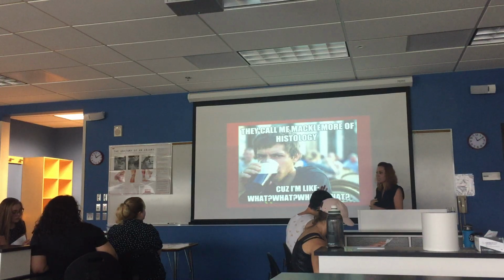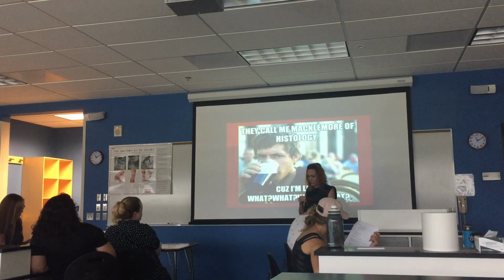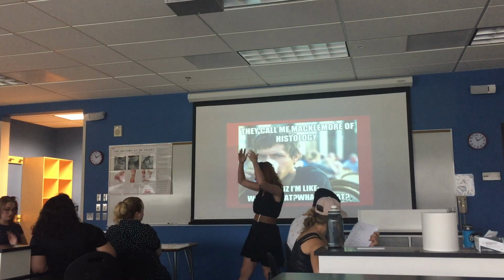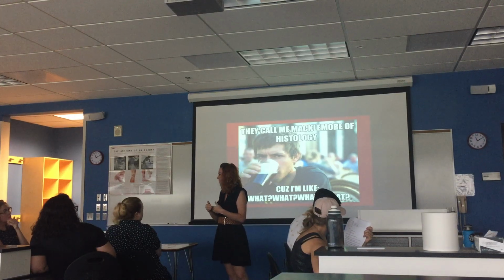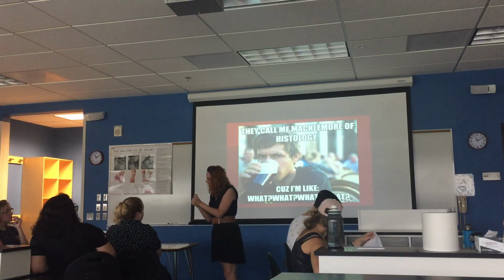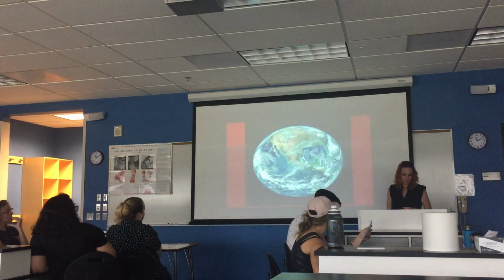Google image searching is super powerful for doing histology. Like if you're looking at your slide and you're like, I don't know if I can really see my ciliated pseudostratified columnar epithelial tissue that I'm supposed to be looking for. Okay, you can Google image search that, and it'll show you so many other versions of it that you'll be able to identify it on your own slide after that, right? Another thing is that you can also use your cell phones and put them up to the eyepiece, the ocular, on these and take your own pictures of these slides so that you can mark them up or AirDrop them to everybody in lab or whatever.